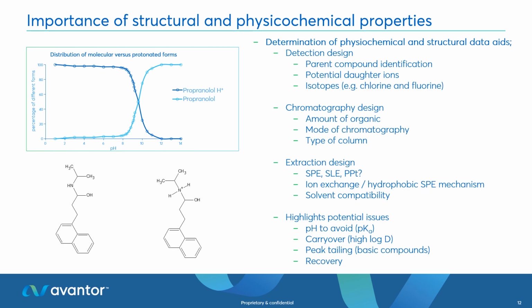In terms of the extraction, this also gives us a good indication of the approach to use. Charge states are very good with charged SPE media or mixed mode media. It can also give us an indication of the type of mechanism, hydrophobic or ion exchange. As well as this, it can also highlight potential issues. So the pH to avoid I've already discussed in terms of the chromatography.